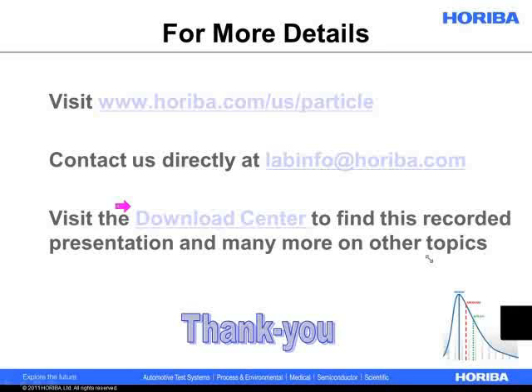All right. Feng Xiao asks another question. For multimodal peaks, how do we calculate aspect ratio? The report has a peak 1:2 aspect ratio. How is it calculated? I believe it's just a ratio of two different key parameters. It's not a true aspect ratio. It would be a true aspect ratio in the situation I just described, where it's a needle. Then you can think of it as the actual particle aspect ratio. Otherwise, it's just going to be the ratio of two different parameters for the two different peaks.